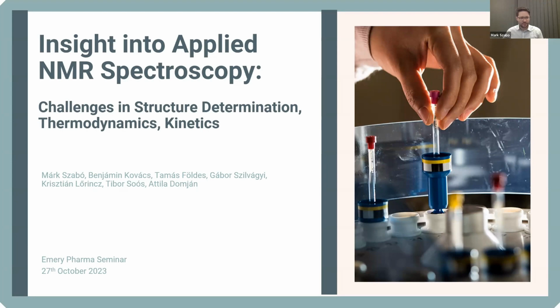I hope you can see my screen. And so yes, today I'm going to introduce you to 4 short stories about the application of NMR spectroscopy. There will be some tricks how certain structures can be determined, and also how certain thermodynamics and kinetics parameters can be found hidden in the NMR spectra, and which can help us understand certain systems.